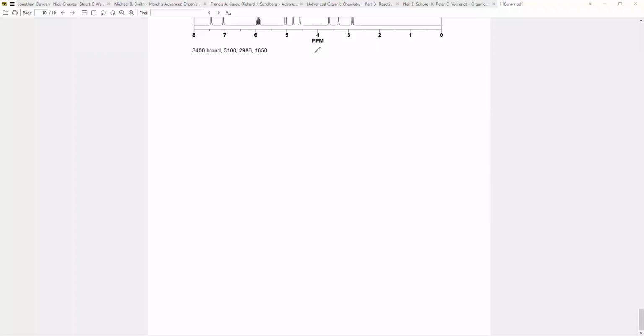Chemical equivalents and splitting and whatnot, and what we would normally expect. So let's say that I had a propane. Okay, I can make a couple guesses as to this propane's chemical environment and what hydrogens we have just by looking at it, right? And looking for any unique hydrogens and symmetric hydrogens. So what I see on propane is this CH3. I see a CH2. And then I see this CH3 over here.